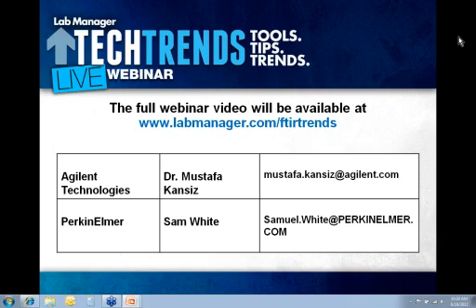You must build your own library. You must run your own samples. You must do your own identification. And the spectra you get from near-infrared are not very telling. So if you put in a total unknown, near-infrared is not going to help you. The opposite is true in mid-infrared. If you run a sample by mid-infrared, the spectra is very diagnostic with very little education. You can tell a great deal about the makeup of the molecule. So really, when it comes to nutritional supplements, it really boils down to what's your workload and how much do you want to spend on the instrument.